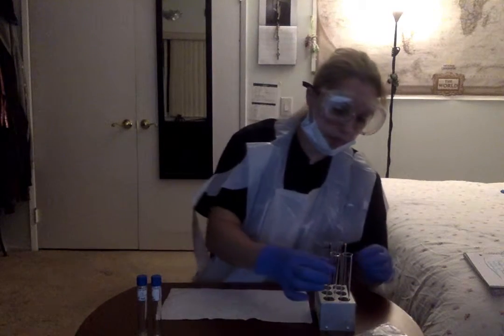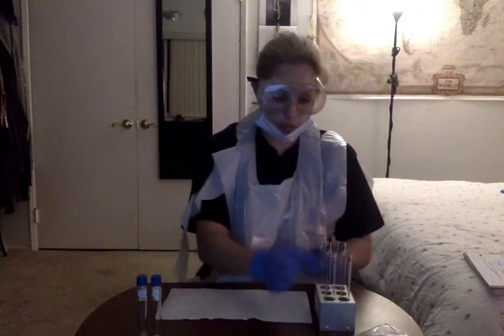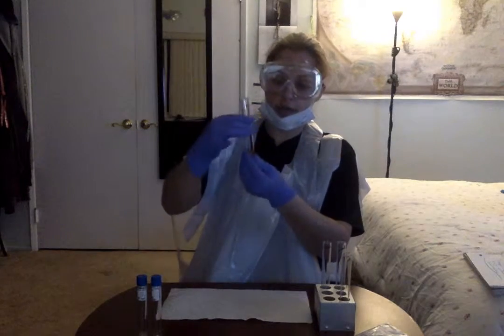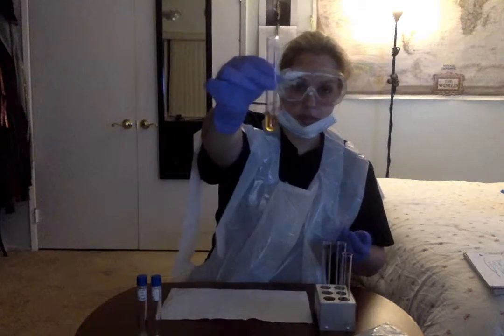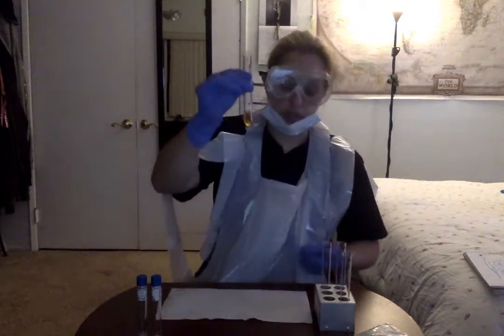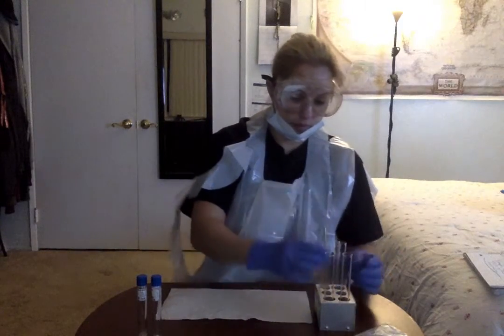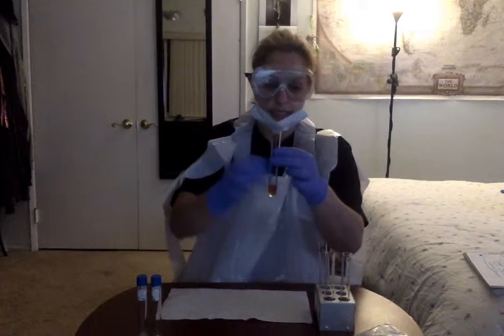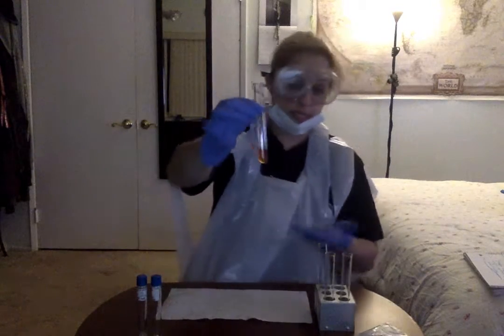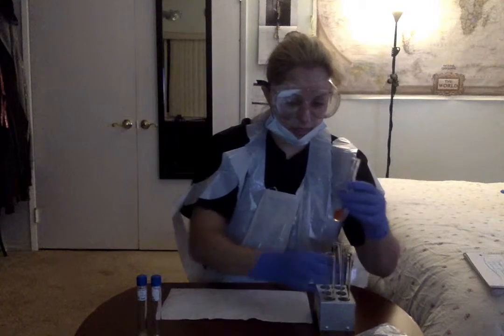I took a couple drops of the methyl red and applied them to 1 tube each. So one of the methyl red was applied to the E. coli, and actually here you can kind of see the result. It's all kind of just a neutral yellow color, which is really the color of the dye, it seems like. So that's the E. coli. And then this is the S. epidermidis. As you can see, it's definitely more of a redder tone, and so this one did test positive for acidity. So this one's definitely more acidic than the other.